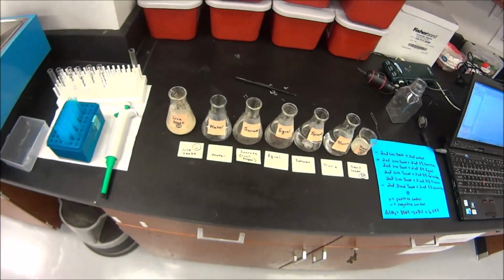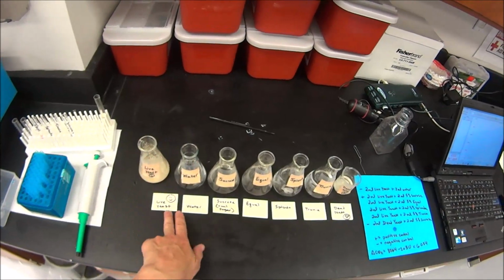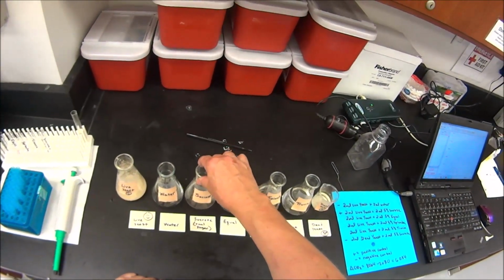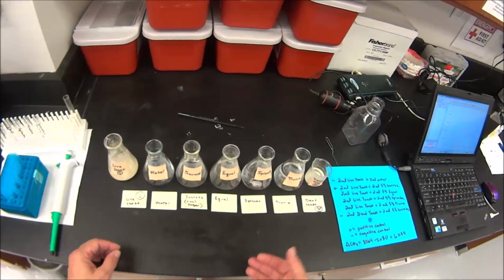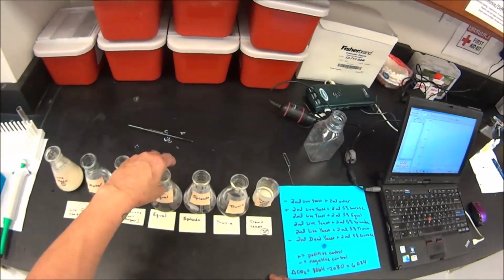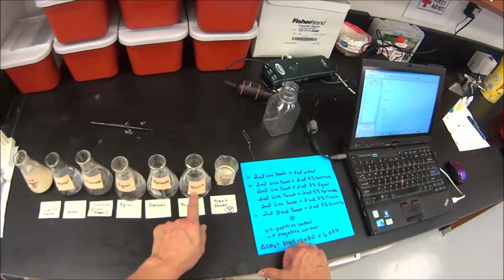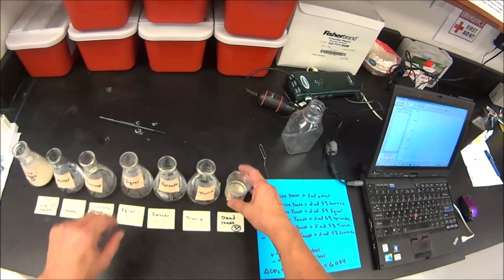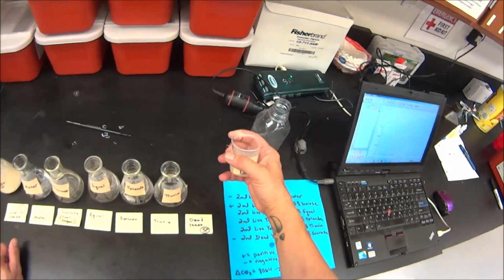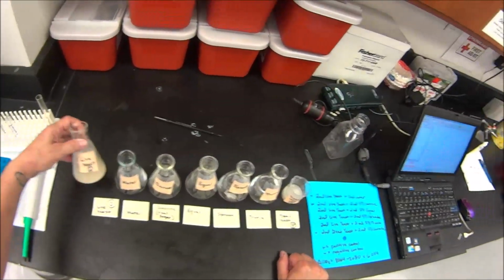We've got a container that contains live yeast. We've got a container of just water. We've got a container of 5% sucrose. That's real sugar, that's table sugar. And then we've got 3 artificial sweeteners: 5% Equal, 5% Splenda, and a 5% solution of Truvia. And then, in our last little jar, we've got some very unhappy dead yeast. Poor little guys. Okay, and our first jar has got live yeast.